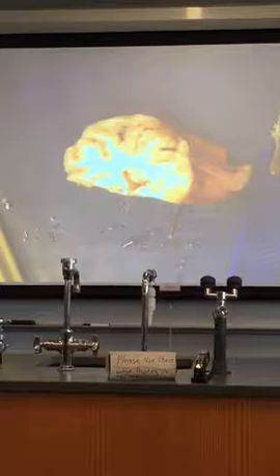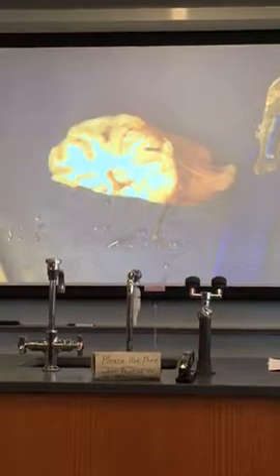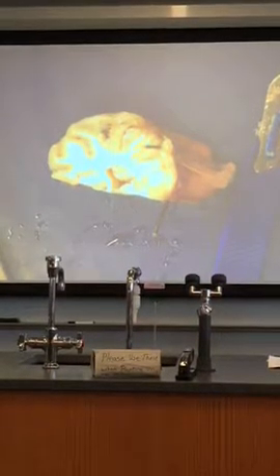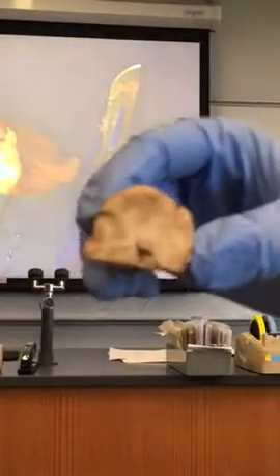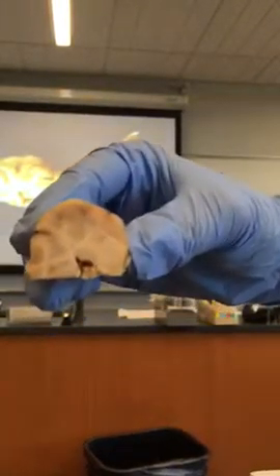So you made a cut right around the boundary between the frontal and parietal lobes, and then you expose the cerebral cortex and the cerebral medulla, the white matter. If you're getting about where you make this cut, you may also start to include nuclei of the basal nuclei in this area here. There's superior and there's inferior. There would be several of them down right in here.